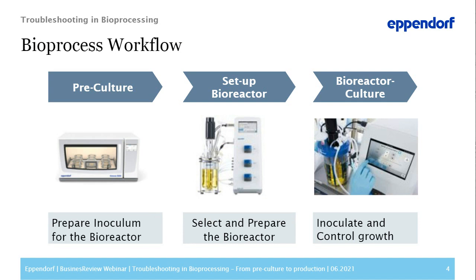So what you see here is the basic steps of a bioprocess workflow. It consists of first the pre-culture or inoculum generation, starting usually in a shake flask. Second, the bioreactor must be set up and prepared for cultivation. That includes not only selection of the system, of course, but the sensor calibration and sterilization. And once the bioreactor is prepared, cells can be inoculated in the bioreactor, and the actual bioreactor culture starts. And with this, the growth must be monitored and controlled.